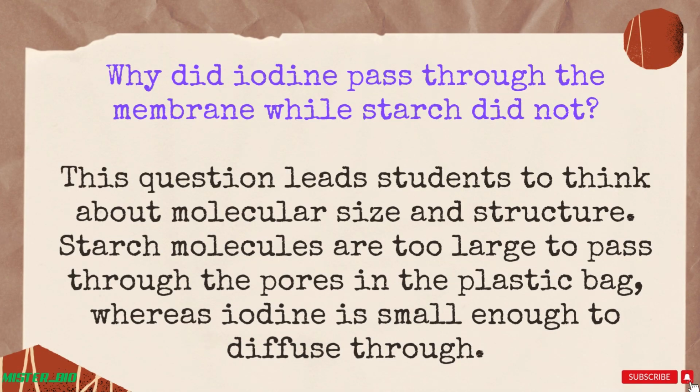Why did iodine pass through the membrane while starch did not? This question leads students to think about molecular size and structure. Starch molecules are too large to pass through the pores in the plastic bag, whereas iodine is small enough to diffuse through.